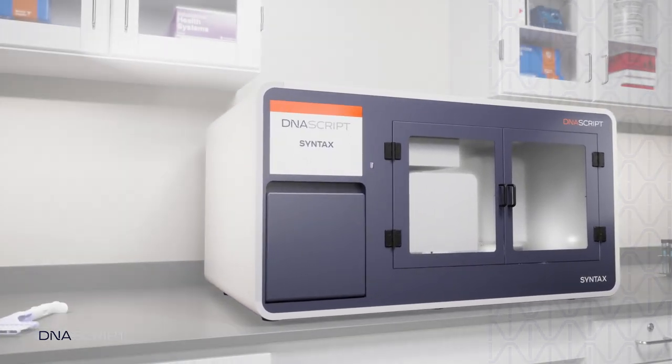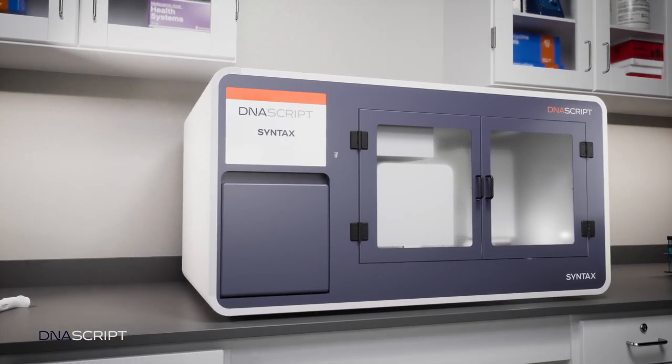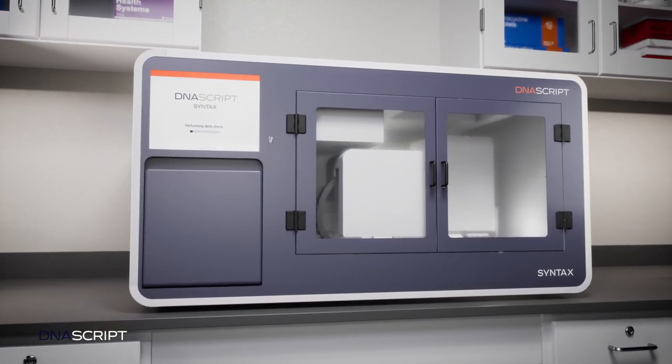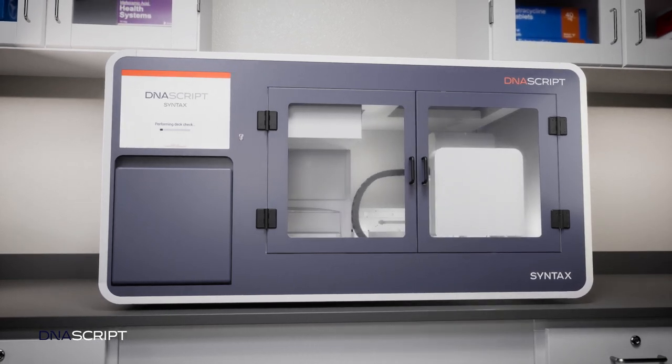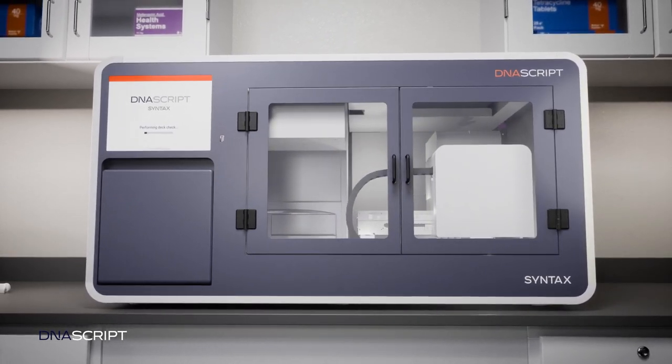By combining benchtop convenience with same-day results, the Syntax system produces high-quality DNA oligos and puts you back in control of your experimental workflow.